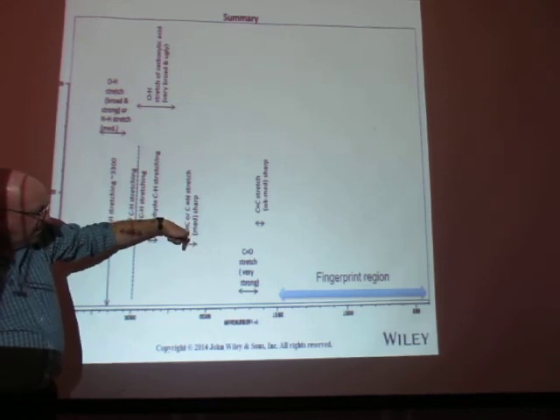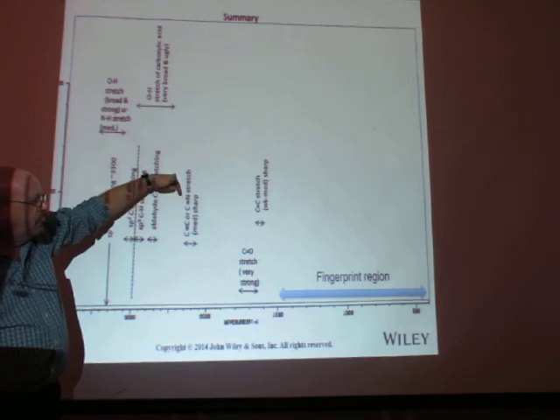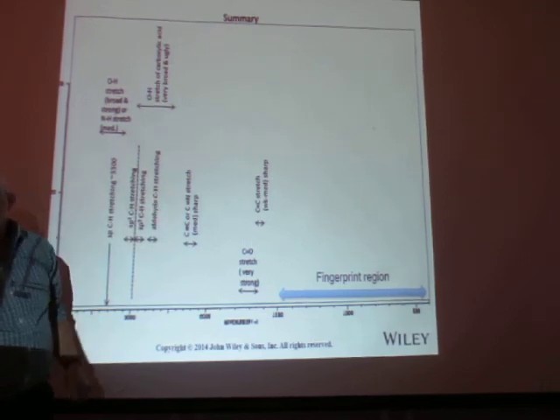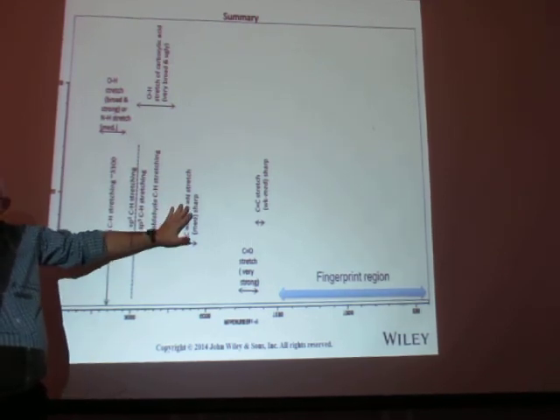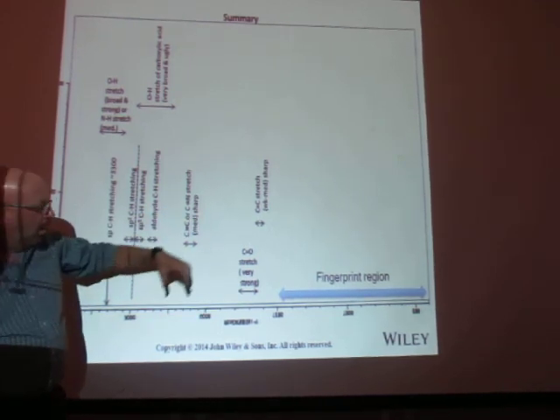Here in the 2100-2200 region, that was a carbon-carbon triple bond or a carbon-nitrogen triple bond. Again, I will not have you pick between those. It's difficult to tell the difference in those. They're about in the same region there.